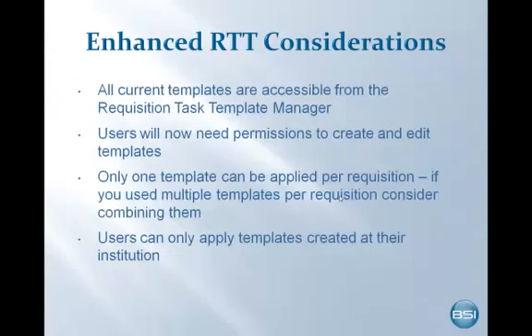If you turn on the Enhanced Requisition Task Template functionality for your BSI database, here are some things you should know. Current templates will be saved and are accessible via the new Requisition Task Template Manager. Users will now need permissions to edit these templates and to add and edit new templates. Only one template will now be allowed per requisition. If you have applied multiple templates to requisitions in the past, please consider combining them.